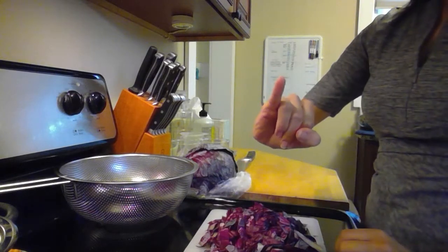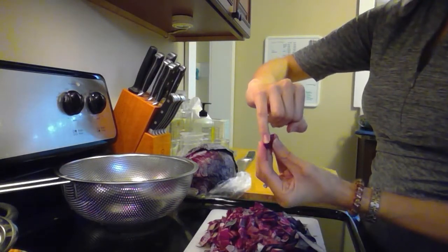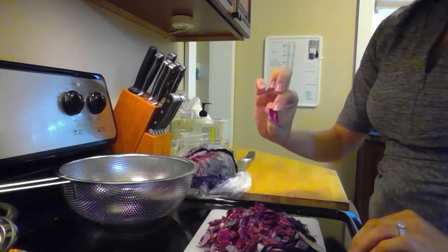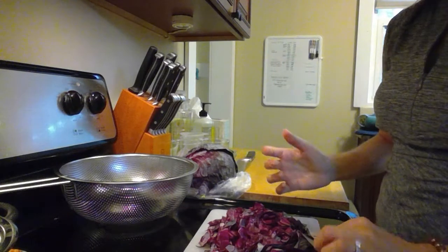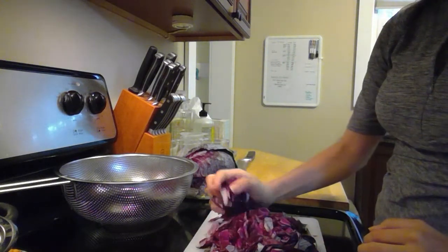So again, you can use your pinky. About the width of it is roughly 1 centimeter. Okay, so you want to go through and cut your cabbage up into little strips. Now you can leave it as a strip, or what I did is I went through and I diced it up into even smaller pieces.